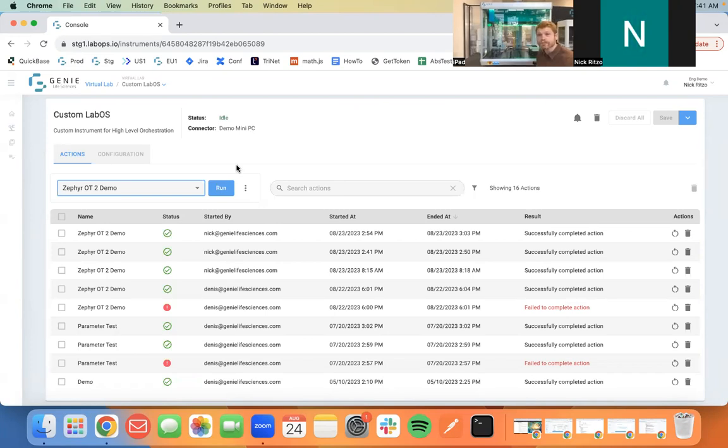But if you need to step further into the complex world of work cells, and you have the ability to code for yourself or you would like us to come in and code something for you, you now have the ability to perform basically any function that could be possible with your current automation. With this, it allows for a degree of modularity and flexibility in your current automation that would not be provided by any other liquid handler or automation control services.